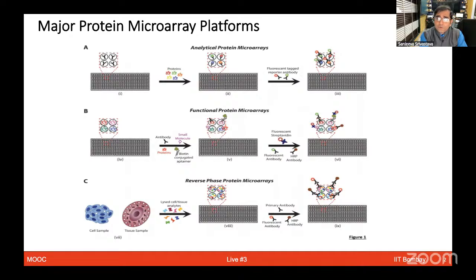Additionally, in many clinical applications, clinicians look for some abundant biomarkers. For example, if elderly men go for a test for prostate cancer, small tissue samples from, let's say, 1,000 patients will be printed on a small chip. And all they are doing is looking at the anti-PSA antibody, which looks at the abundance of that protein in every patient sample.